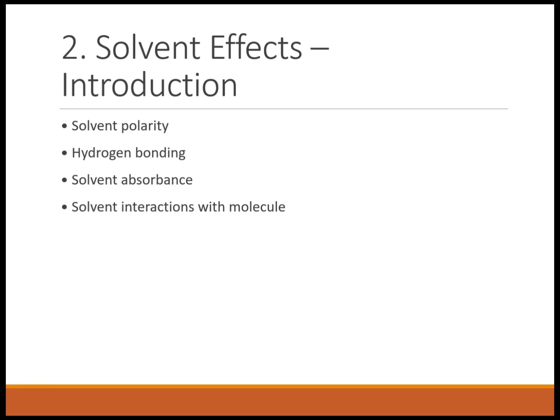Solvent effects are very important, and they include hydrogen bonding, solvent absorbance, solvent interaction with other molecules, and also the solvent polarity. We will discuss these factors in detail.